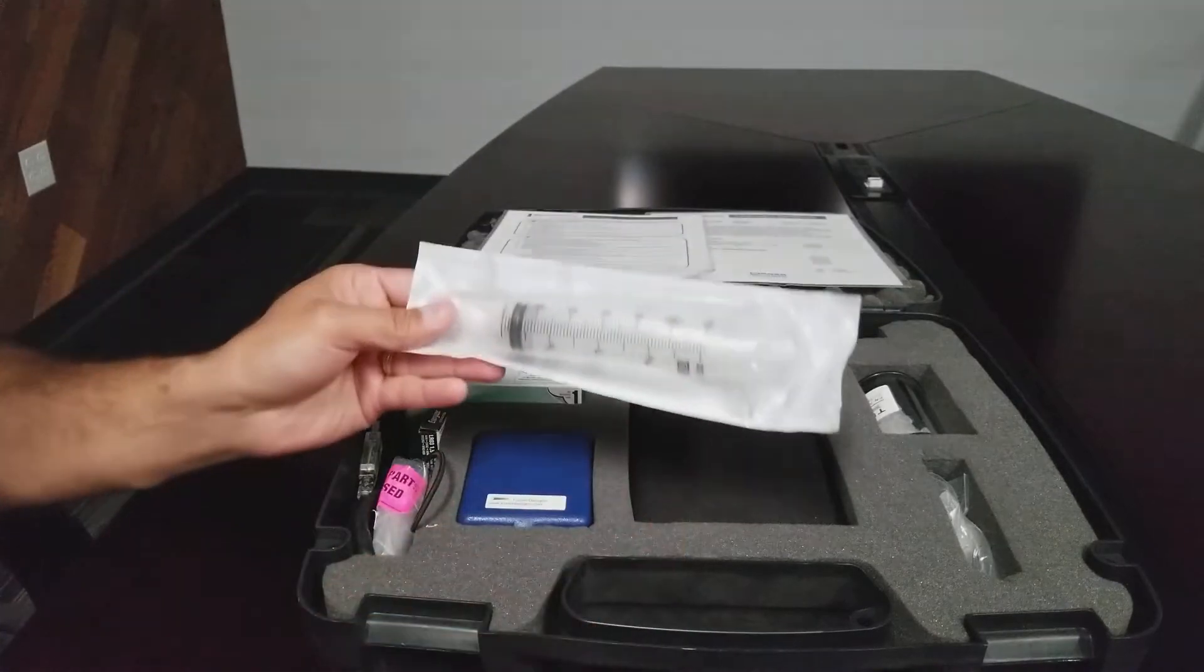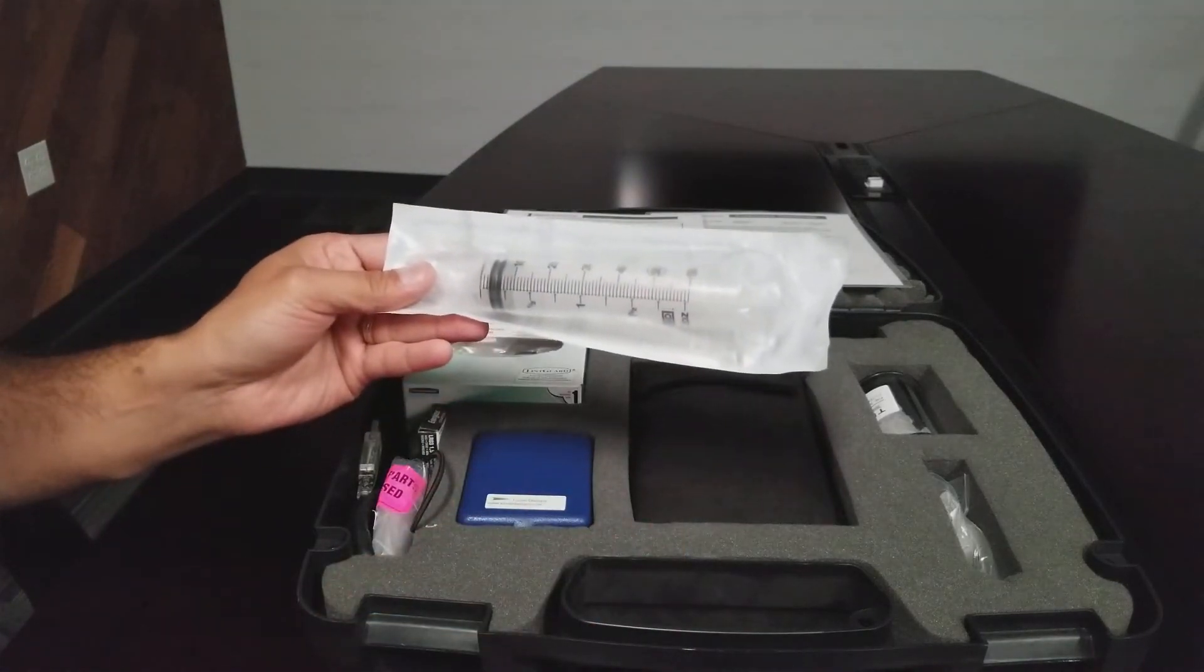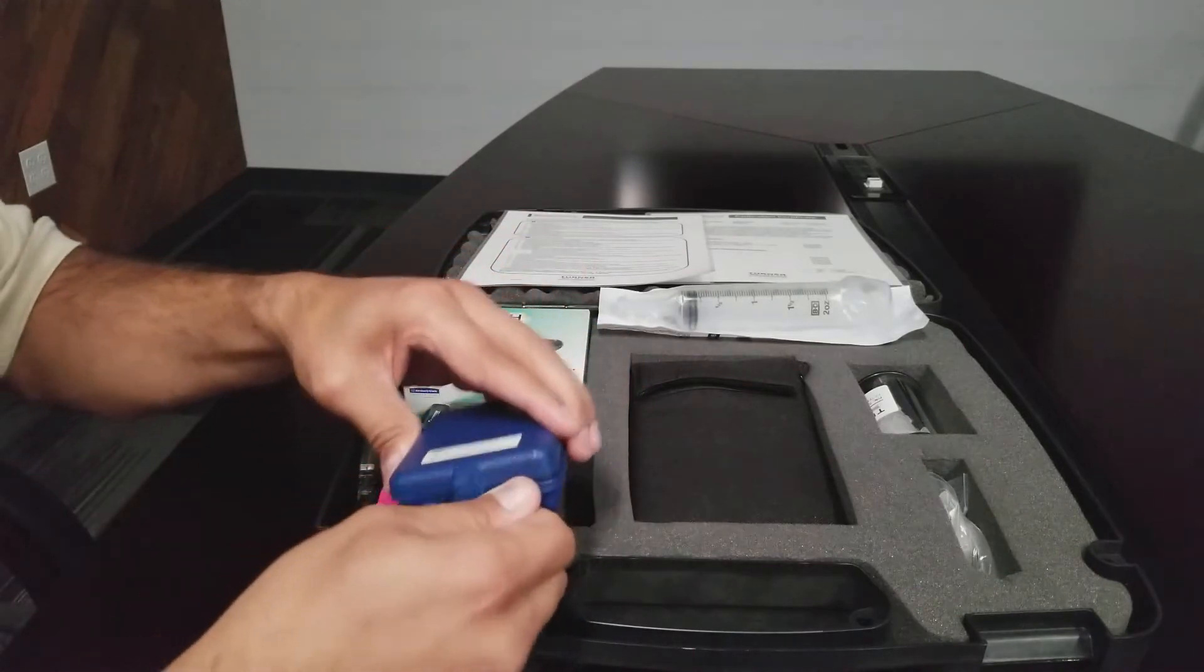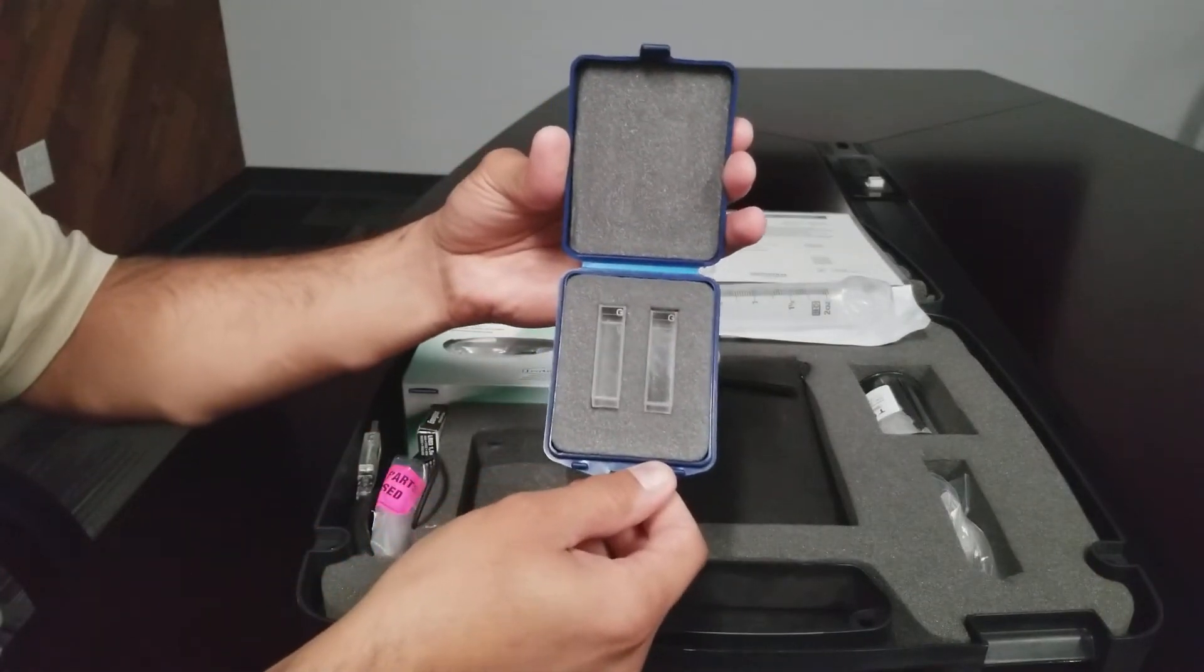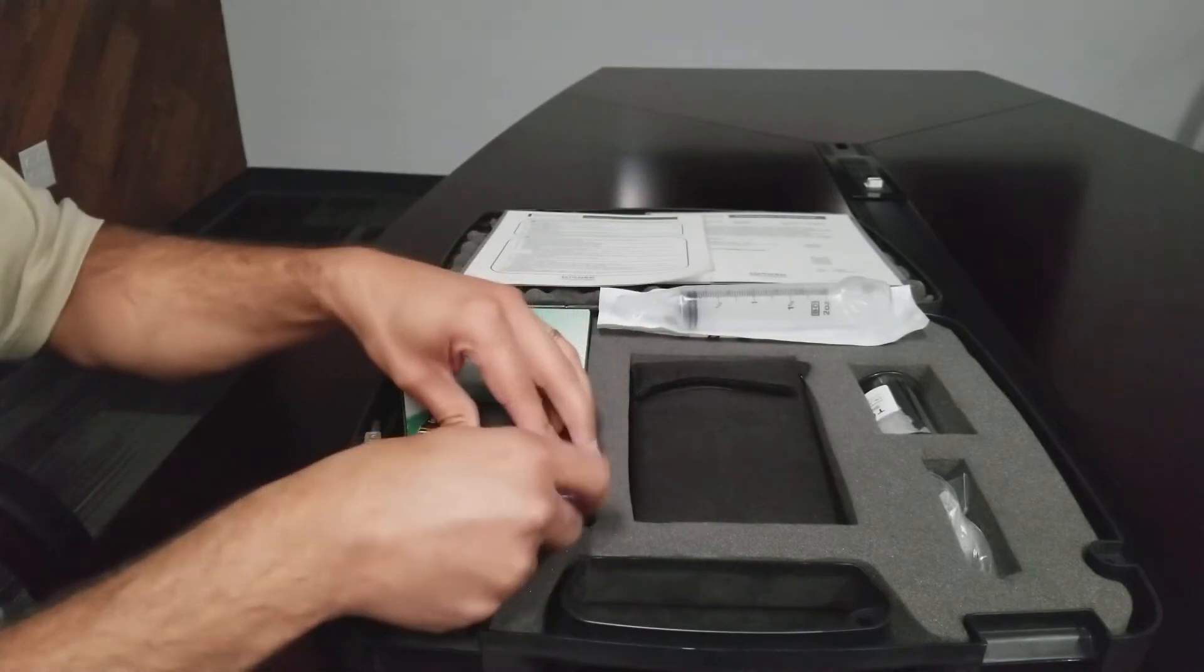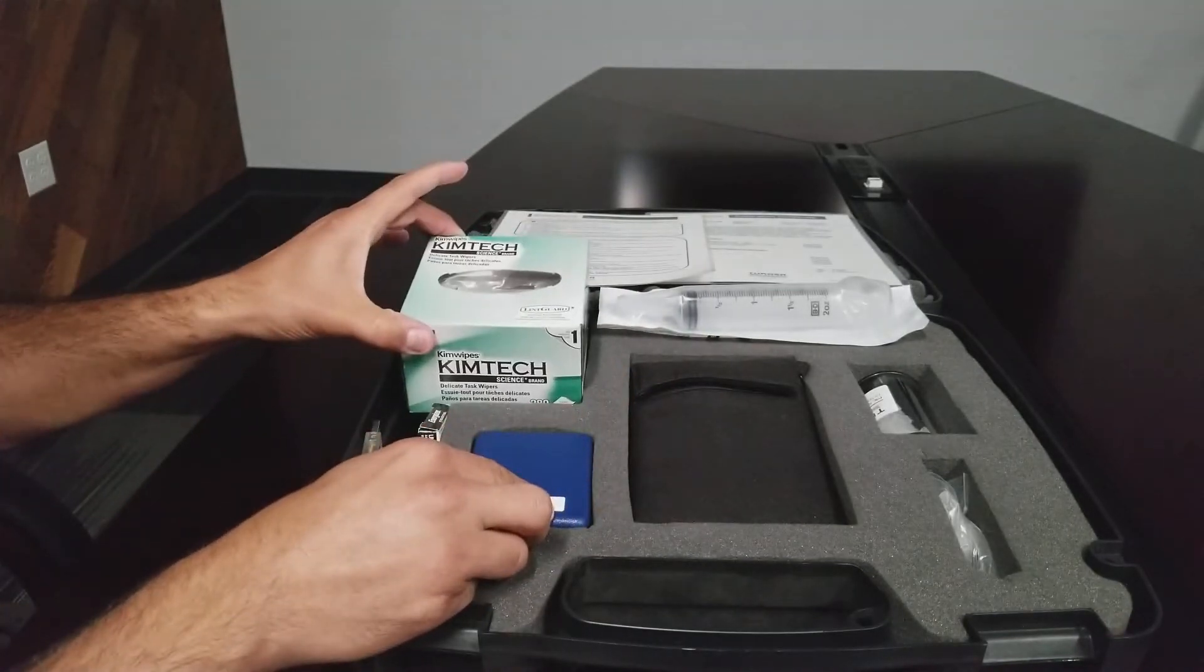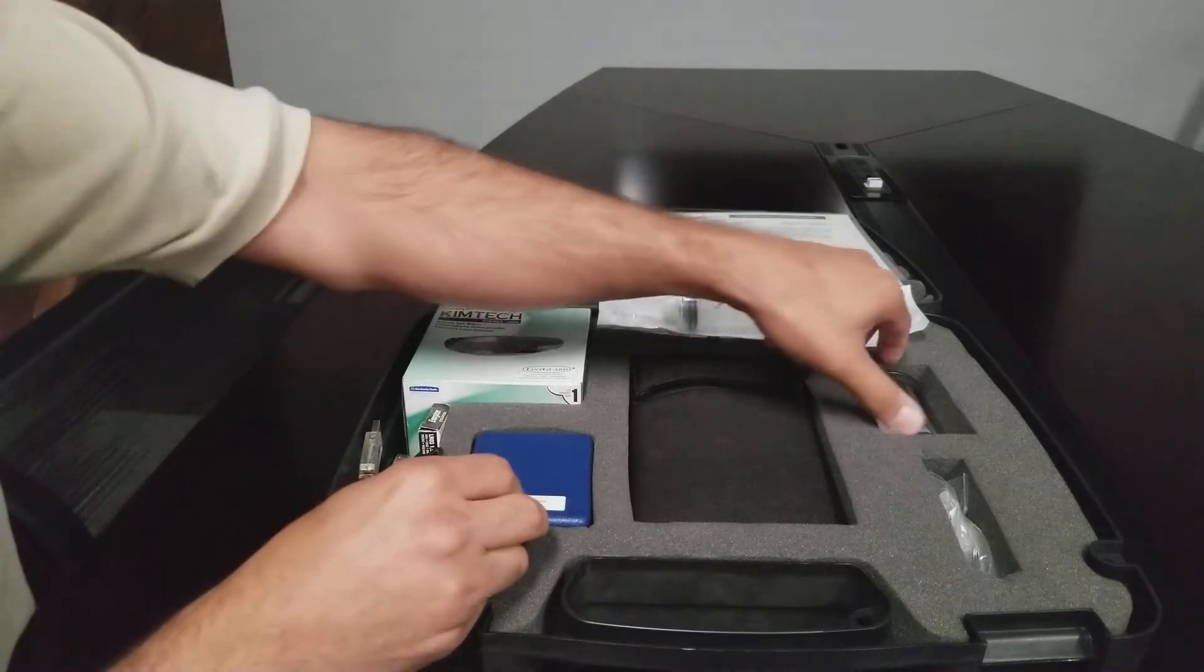A 60cc plastic syringe for sampling. Two glass 1cm square cuvettes. A box of Kim Wipes for wiping down cuvette sides to keep them clean.